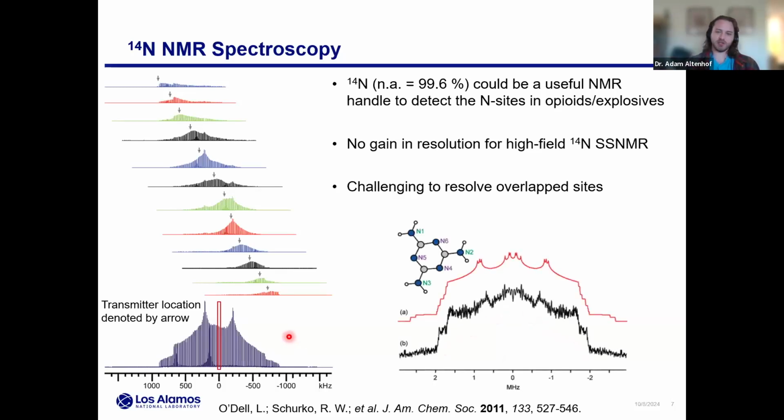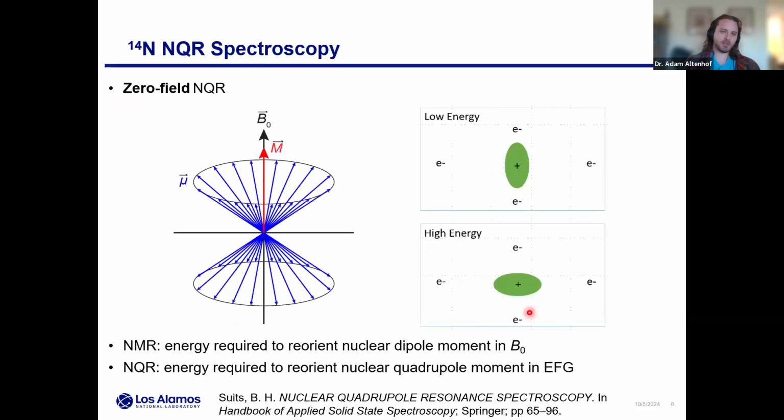To show where this really falls apart, consider multiple nitrogen sites, like in the compound melamine, where there are 6 inequivalent nitrogen sites. What we're showing here is a simulation of the best guess of those individual inequivalent sites overlapped, and what we get in experiments is in black. So, you tell me, in the audience: you measure the spectrum in black, how many nitrogen sites do I have? What are their tensor parameters? This is a pretty difficult task from this data.